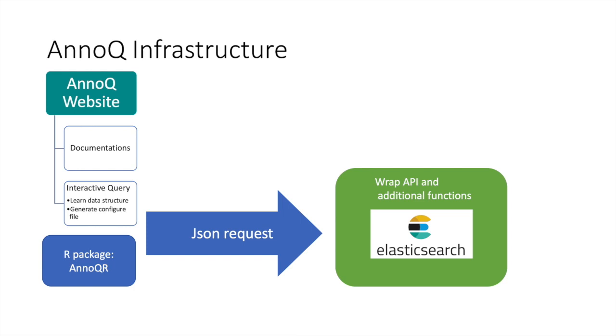Besides those documents, it also has an interactive query part. It is a graphic interface for users to learn the data structure. Besides this, it can also generate configuration files. These configuration files can be used by the R package or other programming languages which use our AnnoQ API.